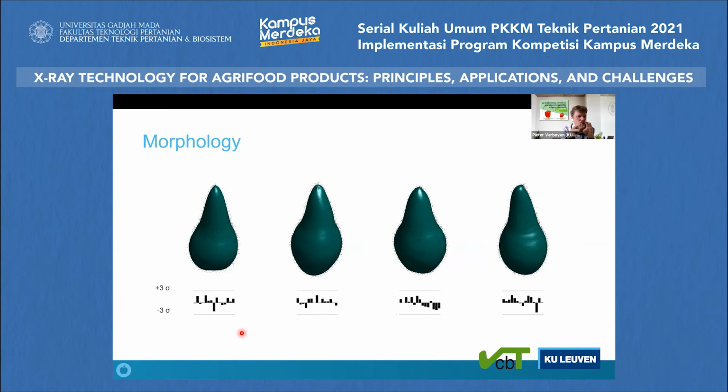Shape variability for certain cultivars, and how do the shape characteristics differ between different cultivars, maybe from batches that have been grown differently or that have been picked at different times. How does that affect morphological properties? Yeah, we also use models for that.